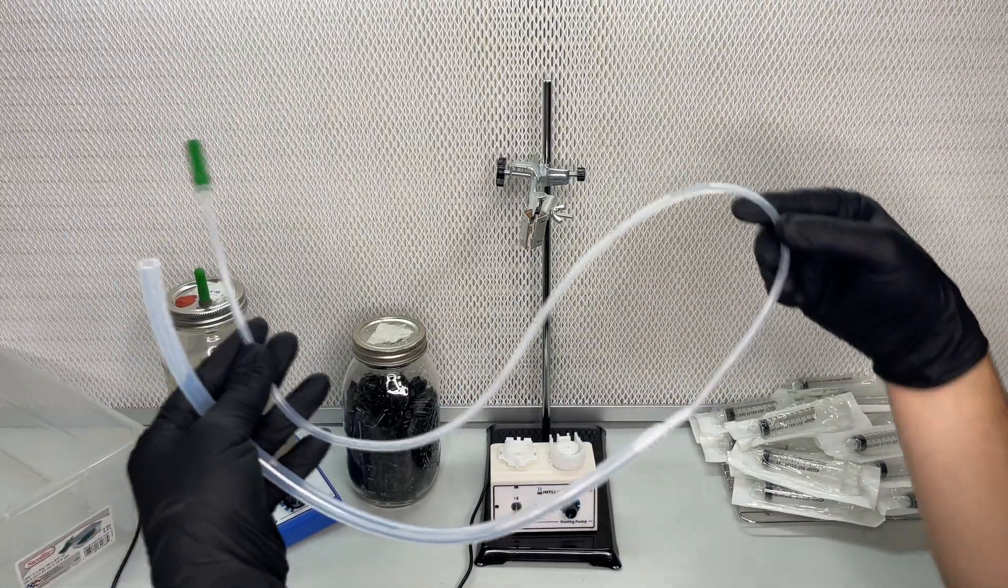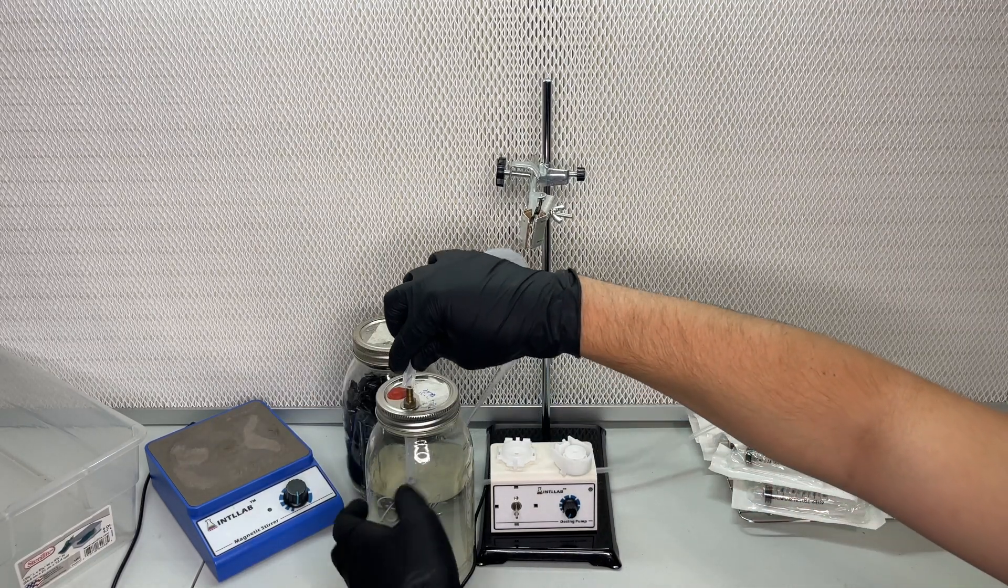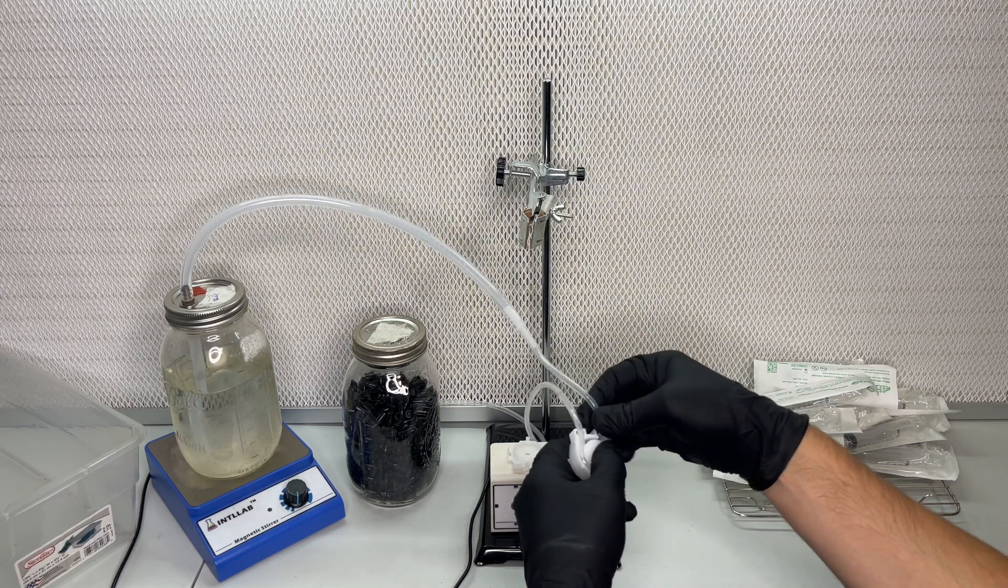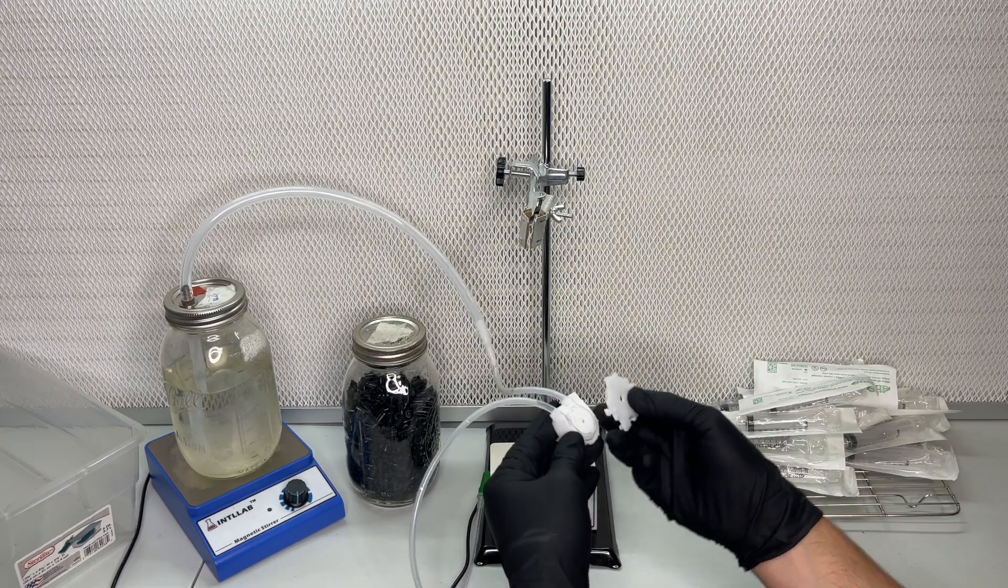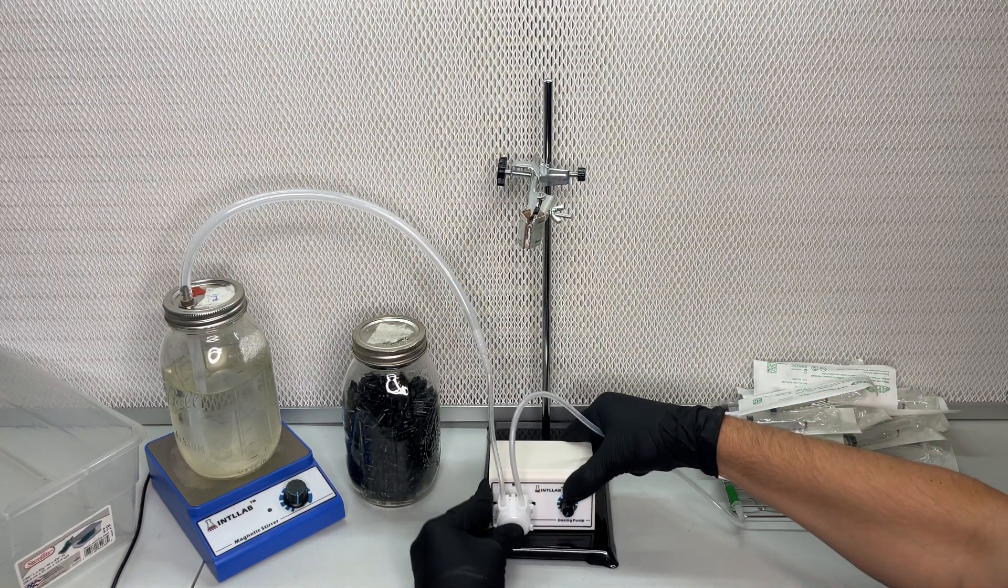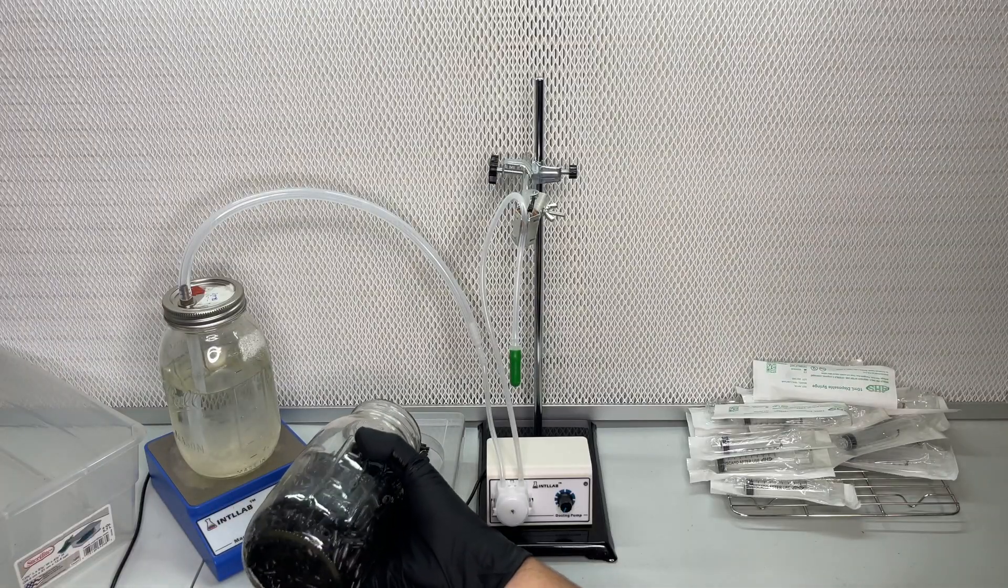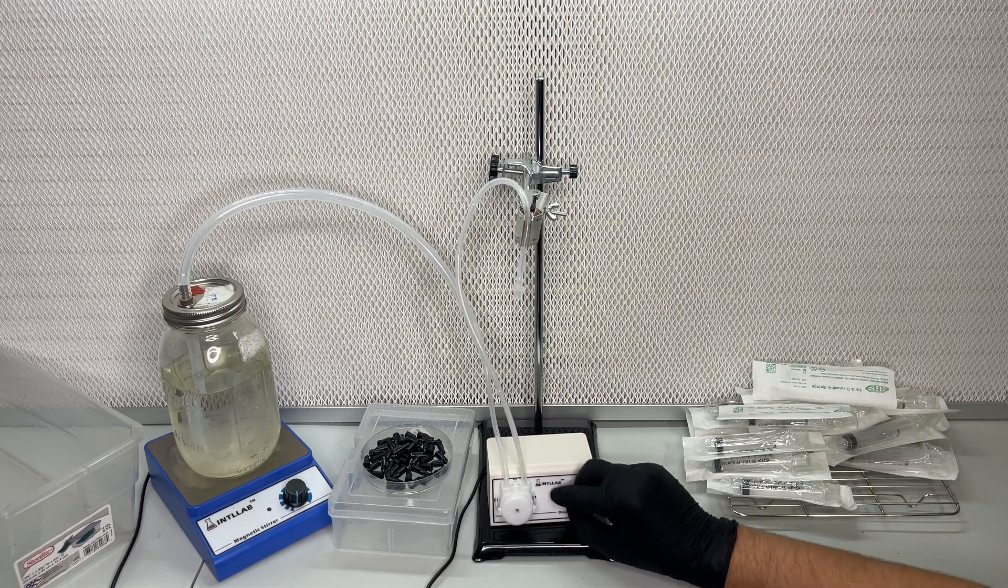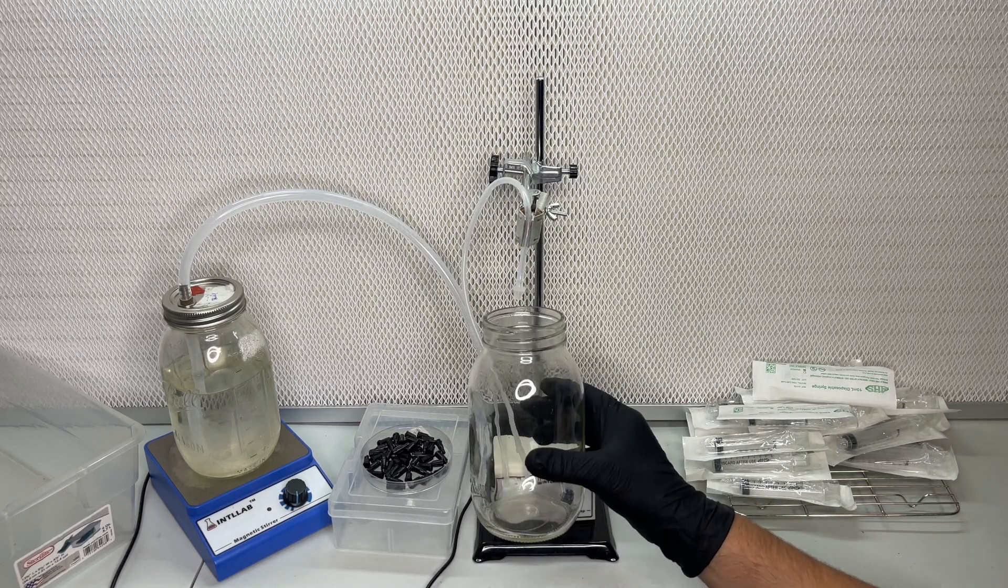I sterilize all the tubing in a pressure cooker and then I attach it from the liquid culture jar to the peristaltic pump. I also sterilized the syringe caps in the pressure cooker. On the very end of the tube I attached a luer lock to one eighth inch barbed adapter to attach the syringe to.